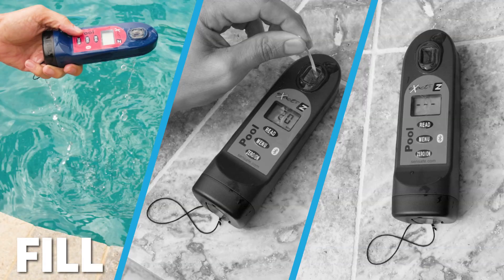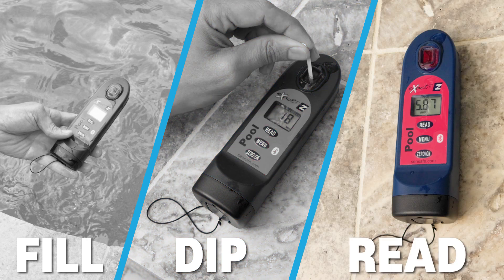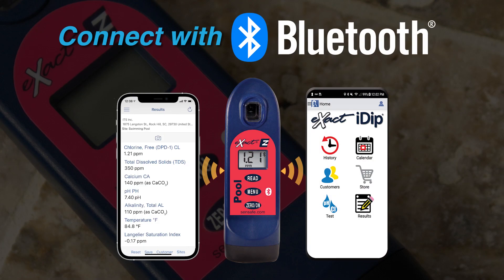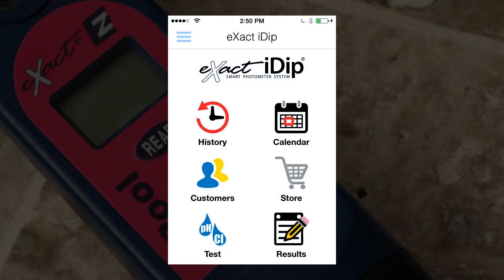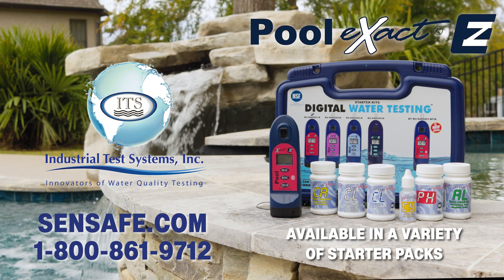Simply fill the cell, stir in the reagent strip, and wait for the result. Get the Bluetooth model and connect with the Exact iDip app for test customization, data storage, GPS tracking, and more.